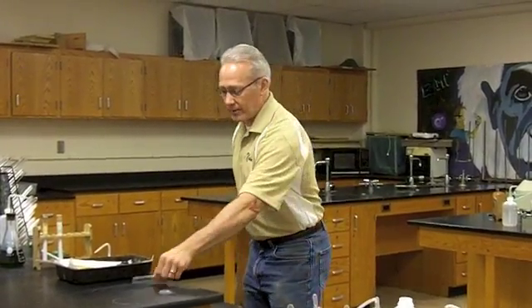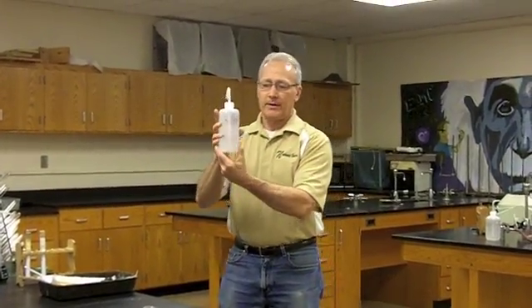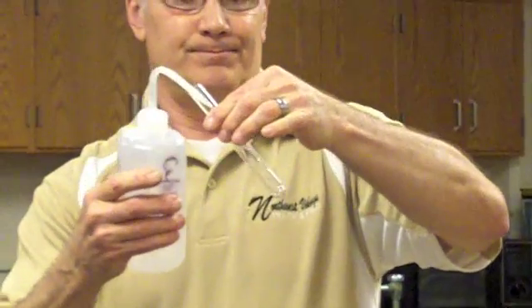The purpose of this video is to show you how to do the J-tube test when you're testing for a carbonate or a hydrogen carbonate. And the directions tell you to get a regular size test tube and fill it 1/3 full of calcium hydroxide. So I'll go ahead and do that.